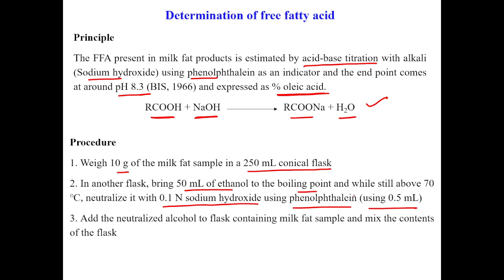So why are we making use of neutralized ethanol? Because ethanol itself may be acidic, so it may also contribute to the acidity. So we are making use of neutralized ethanol.